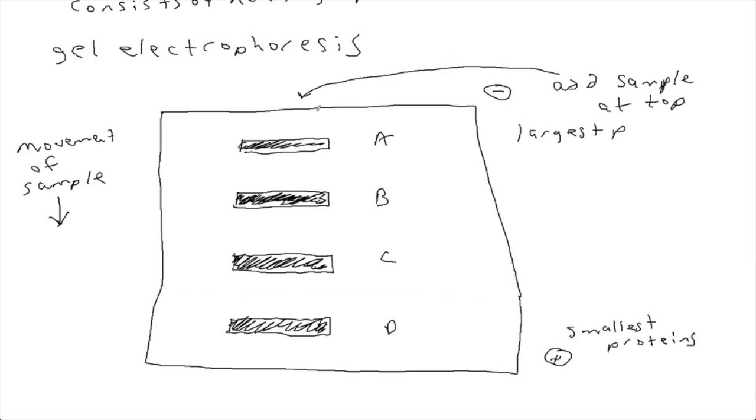Excellent. So the gel that we're using here is like a sieve or a net. It's like a sieve or a net with lots of little openings. While the large molecules have a hard time pushing their way through the net, and the smaller proteins can push through that net, that gel, more easily. Excellent. That's a very good description. Okay, let's see. So a lot of that you already have down. Let's see if there's anything else we have to discuss about that then.